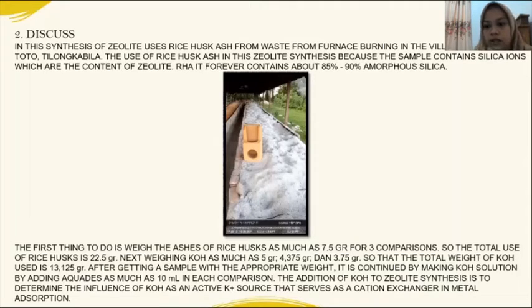So that the total weight of KOH used is 13.125 grams.